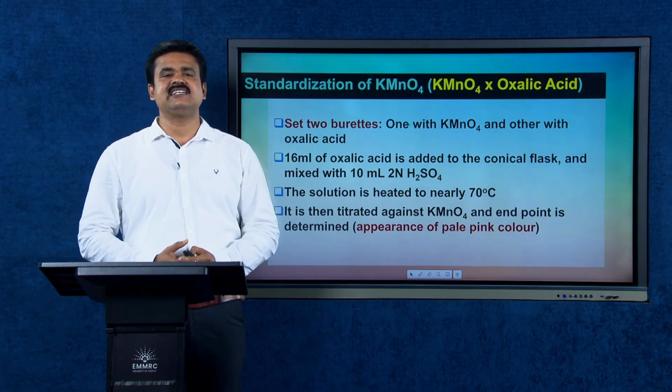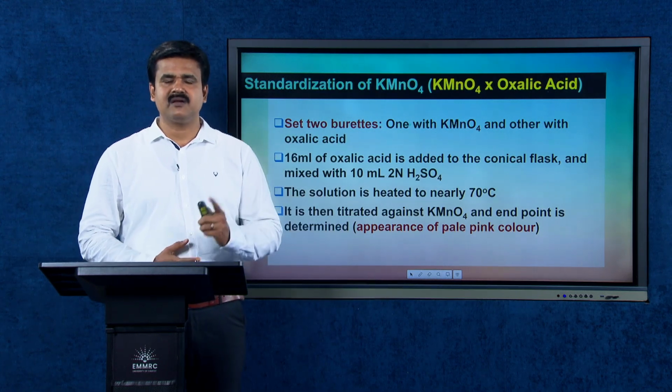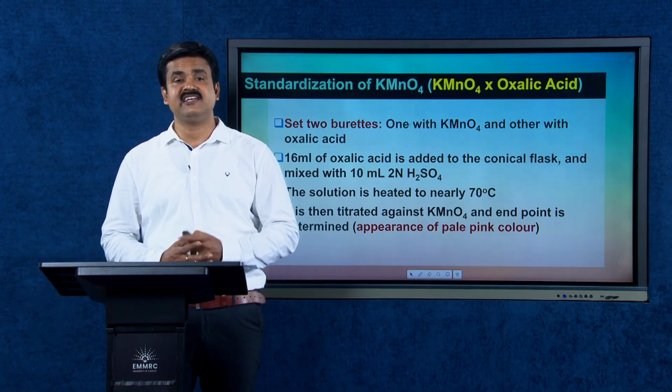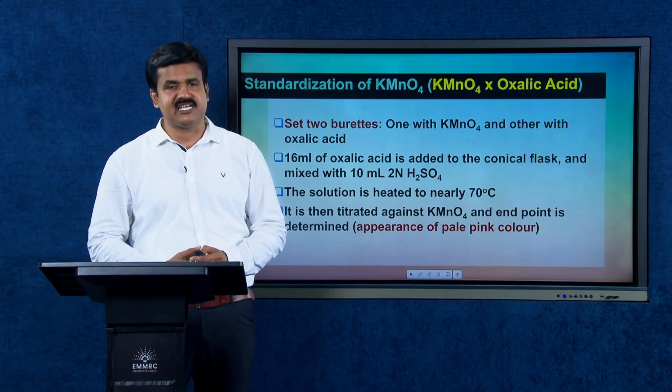It is then titrated against KMnO4 and the end point is determined. Remember, the end point is the appearance of a pale pink color. Here you need not add any external or internal indicator because KMnO4 as such acts as a self-indicator.